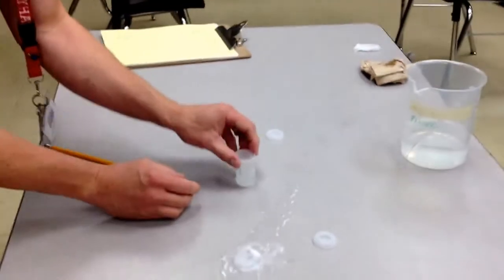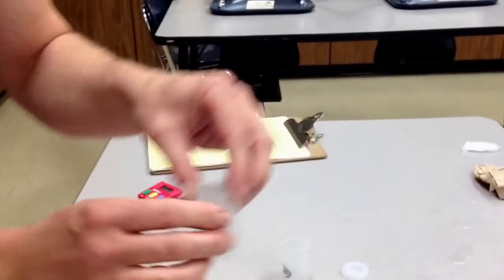I'm going to go down to the 3rd full container.